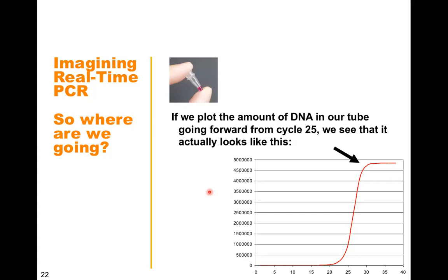So now what does this number represent? So 28 means that to reach the threshold, that is 10 lakh, it takes 28 cycles. In case of cancer, the number 25 means that to reach the 10 lakh range, it needs 25 cycles. And in case of treatment, it needs just 23 cycles. So this is an inverse correlation. The fewer cycles required to reach a particular number, the higher the expression of a molecule.